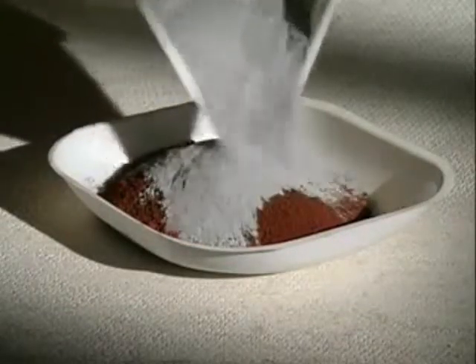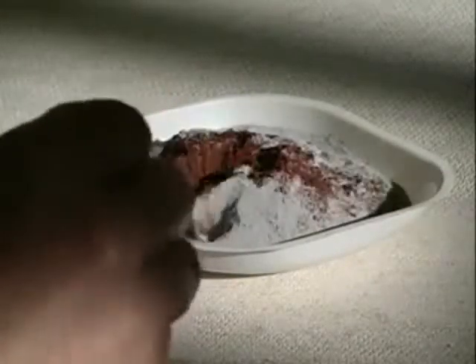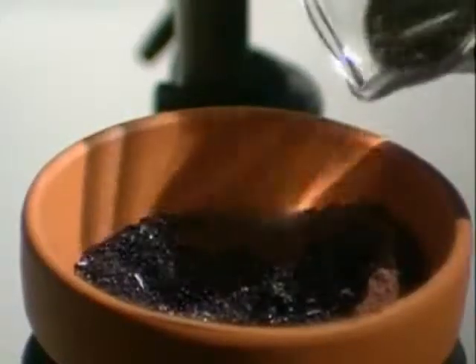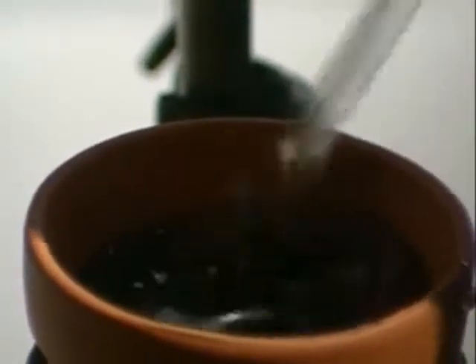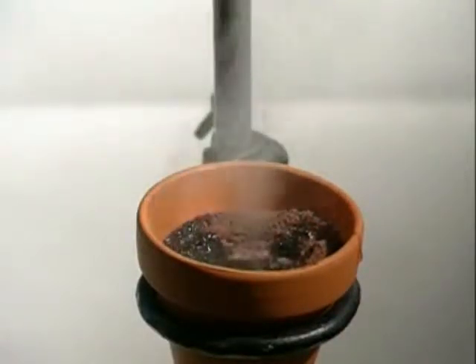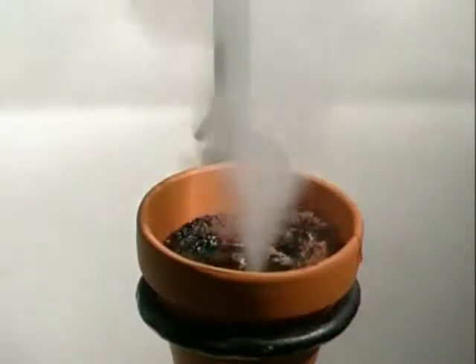Aluminium is another reactive metal. Its reaction with iron oxide gives out a huge amount of energy. A measured amount of aluminium is mixed with iron oxide and placed in a small pot. Potassium permanganate is sprinkled on top, and glycerol is added. The vigorous reaction between potassium permanganate and glycerol gives out enough heat to start the main reaction.